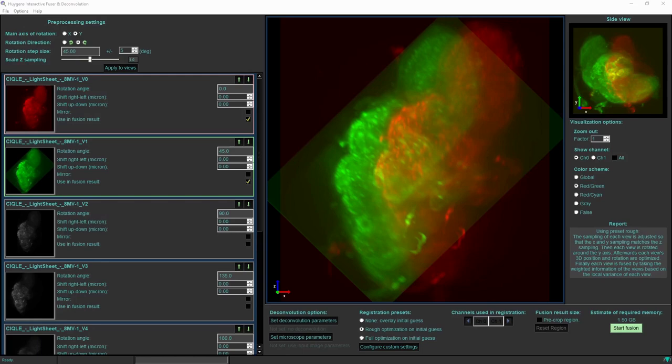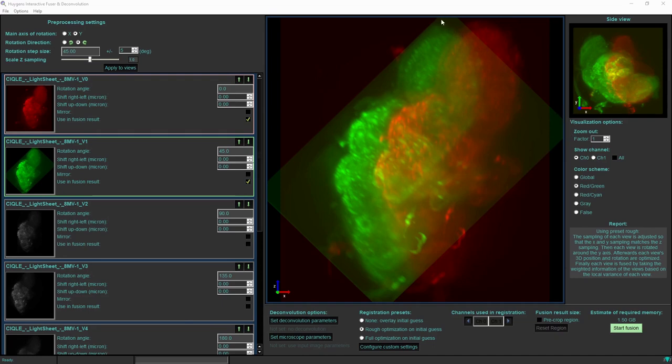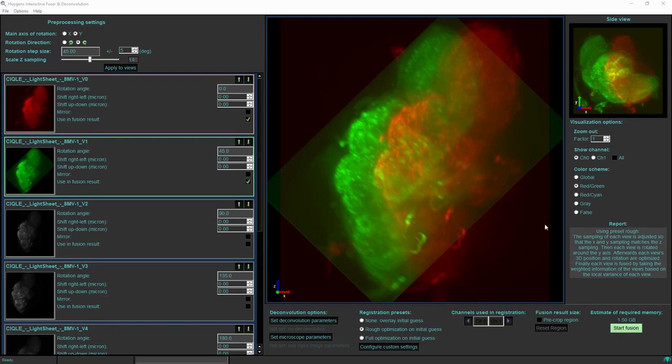I started the Huygens fuser and deconvolution again on the same dataset. I would like to demonstrate the effect of two options in the fuser. One thing to notice here is that we can see an outline of a rectangle which represents the extent of the acquisition volume of each of the views. We see in green an oblique rectangle and in red a rectangle. The fact that we can see those and that the background is not completely black means that there is a noticeable background level present in each of the input images.